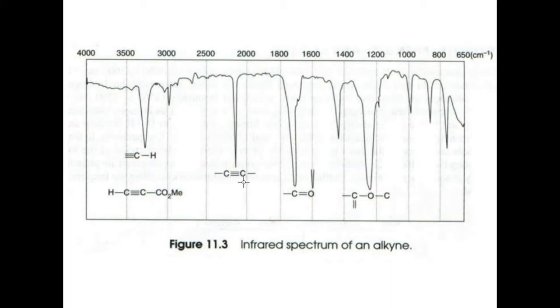The next peak we encounter is a peak for the carbon-carbon triple bond stretch. We note that this peak is sharp and relatively big. And that's because if you examine the molecule, there is a relatively larger polarity to it. The ester group is very electron withdrawing, pulls electrons compared to hydrogen. And that creates a significant polarity in the CC triple bond. Now when the CC triple bond stretches, that polarity gets even larger. So there's a relatively larger change in polarity as the CC triple bond stretches and compresses back and forth. Hence, the stretching motion of our CC triple bond here is fairly large.